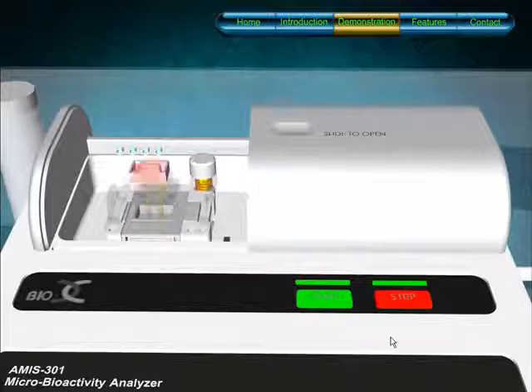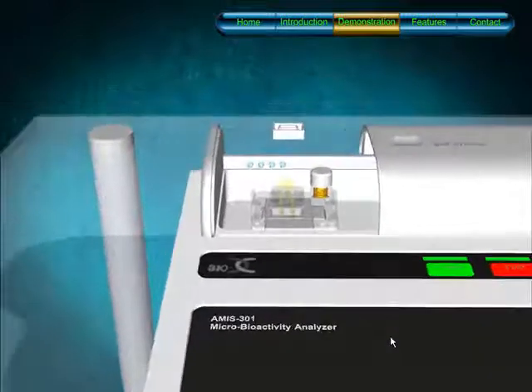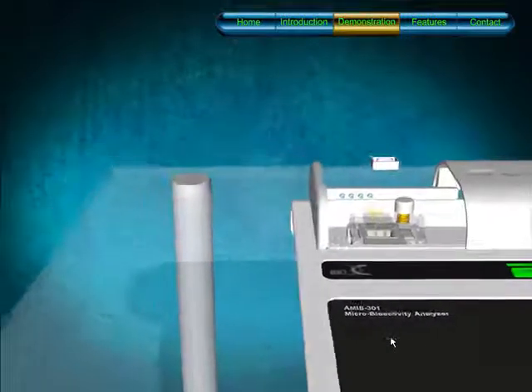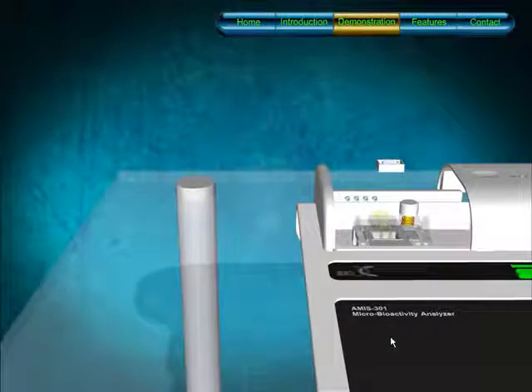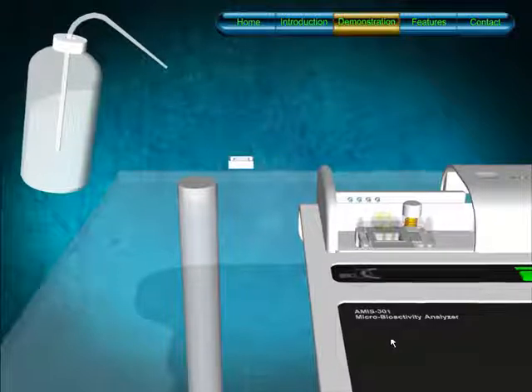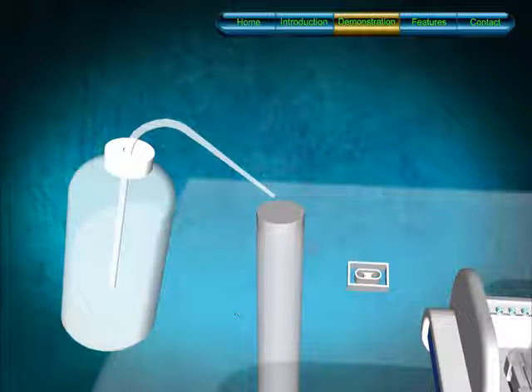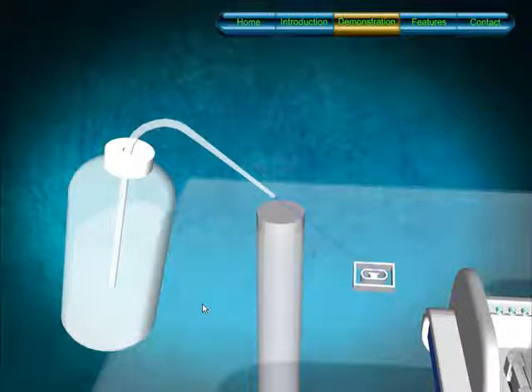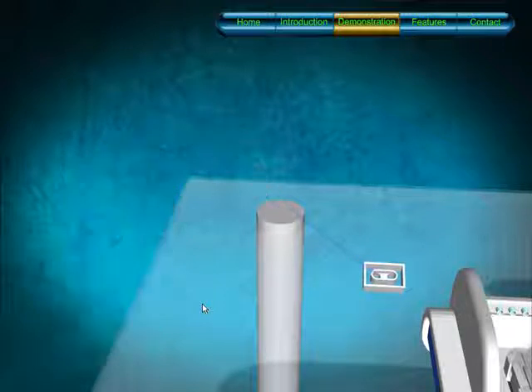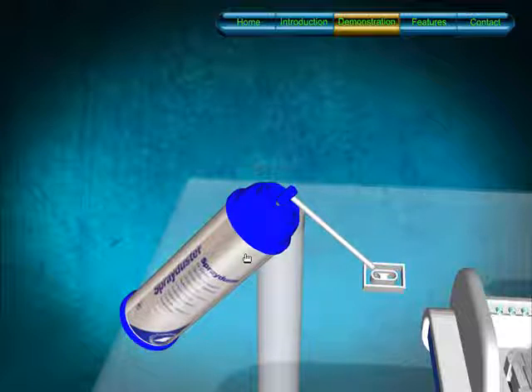The sensors are reusable after cleaning with agents such as DI water and spray duster. Click on the DI water. Click on the spray duster.